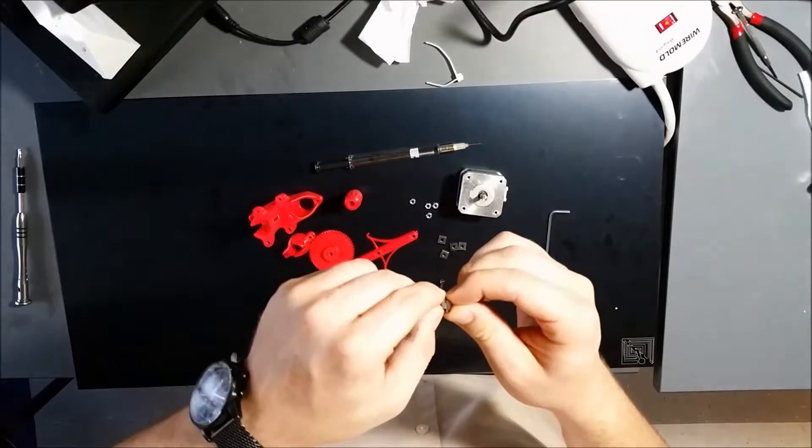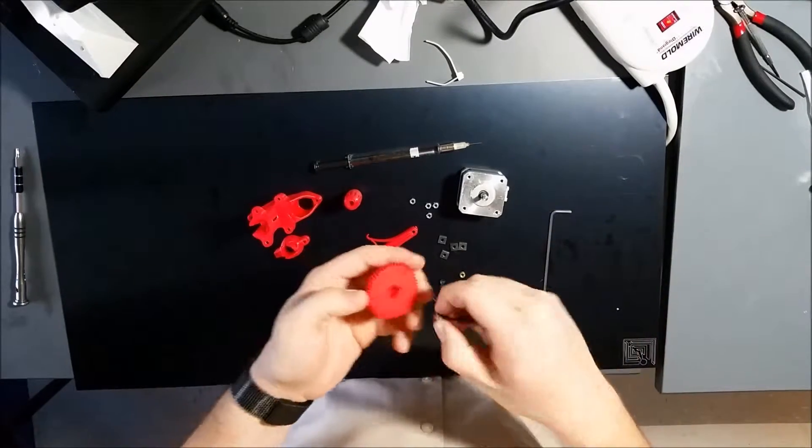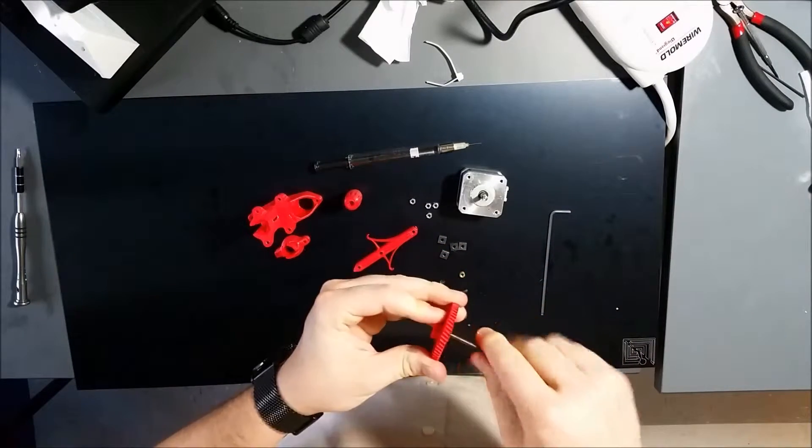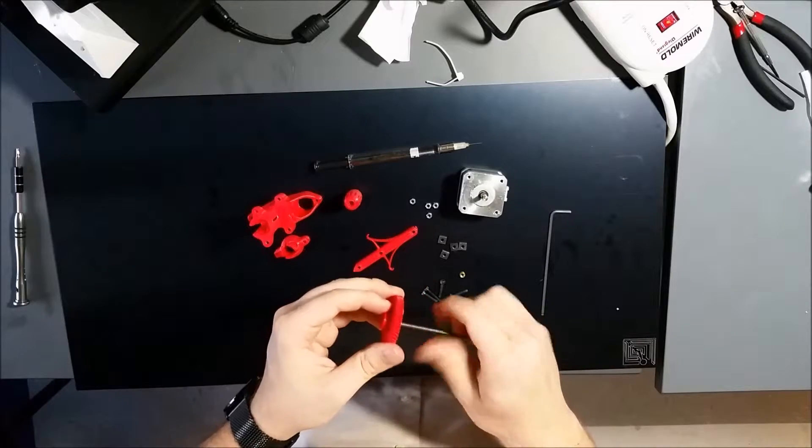You don't want to tighten the nuts completely together, you just want their faces to be parallel and for them to be a little bit loose from one another. Then you're going to take the big gear, the drive gear, and you're going to push both of those square nuts down into it and run the lead screw through a little bit.